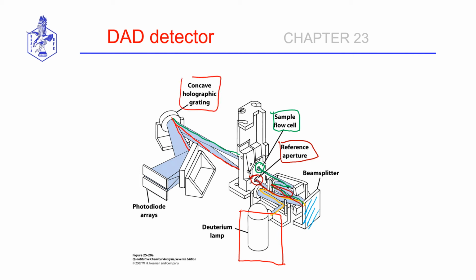The grating is going to split the light into all kinds of different wavelengths, and the angle at which they come off will be detected using my photodiode array, which is capable of measuring the intensity of light at different wavelengths as it strikes the photodiode array detectors all along the two-dimensional positioning of that detector.